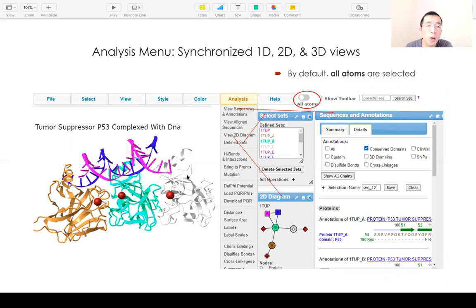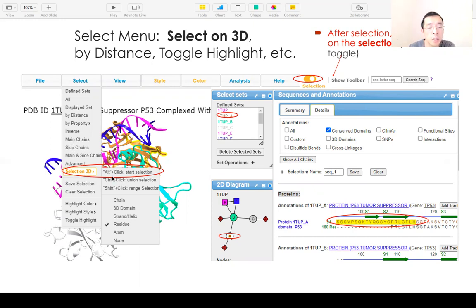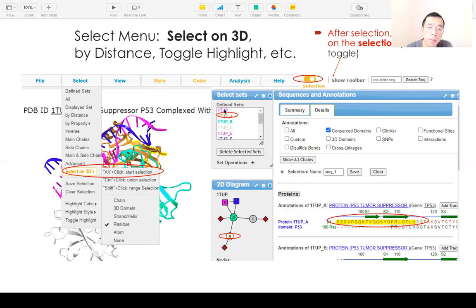By default, all items are shown. You can select a subset of the structure by going to the select menu and selecting on 3D. If you hold the Alt button and click, you can select a residue by default, or you can change to select a chain. When you select something in 3D, it will show up in the defined sets as well.